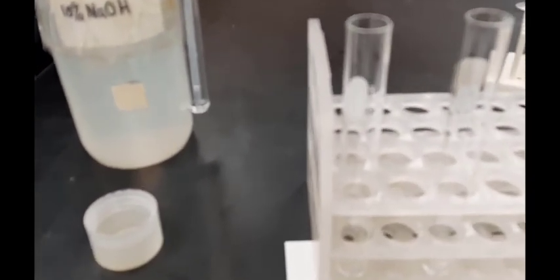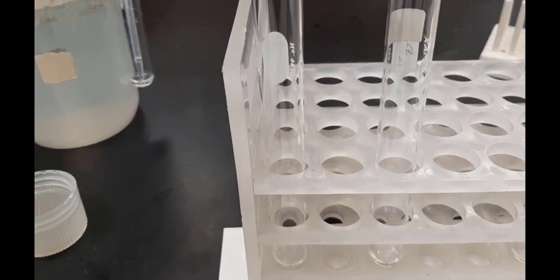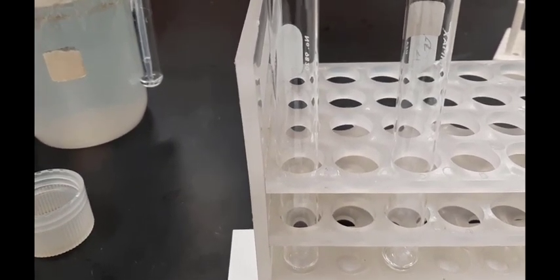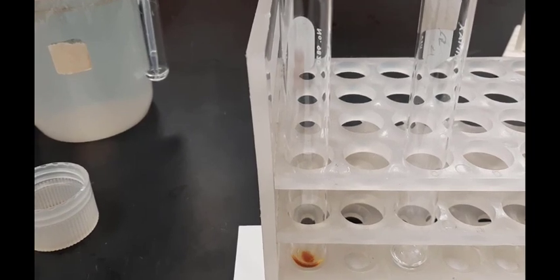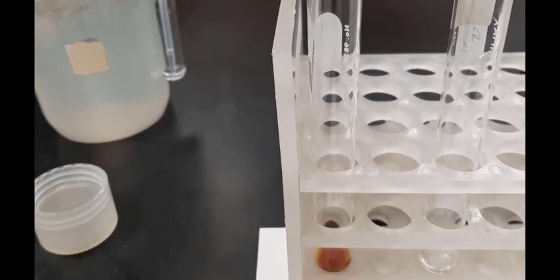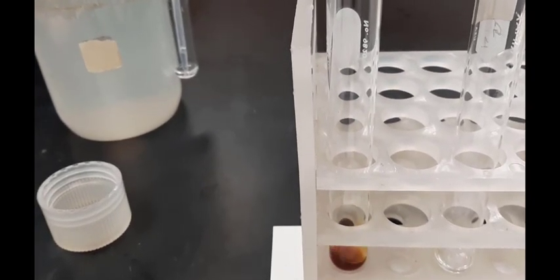Here you see me adding the iodine reagent to the first of the aldehyde or ketone solutions. This first one on the left is propanal. Notice that the propanal, like all the other ketones or aldehydes that we'll be testing, is clear and colorless. And notice that the iodine reagent is brown.